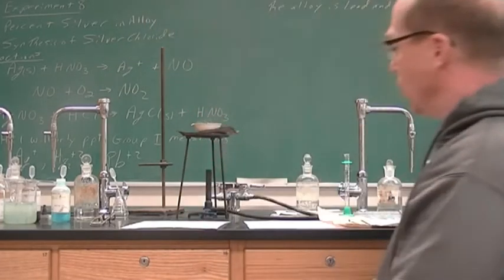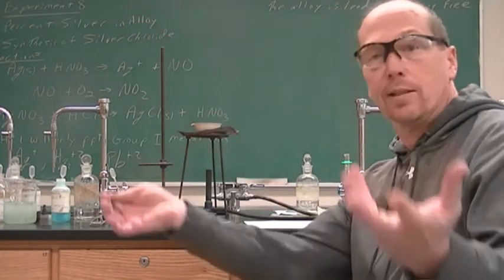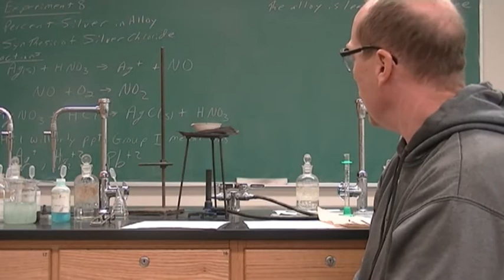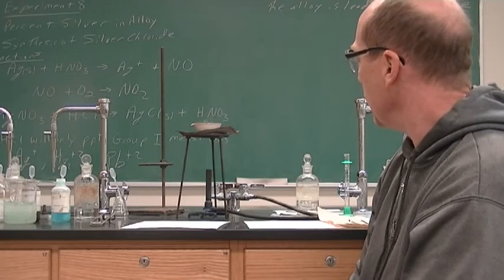Of course, you don't want to lose patience at this time and start cranking it up so it goes faster, and then you plop your egg yolk out. We do not want to lose our product at this point, so we are just going to wait, although a little piece just came out.